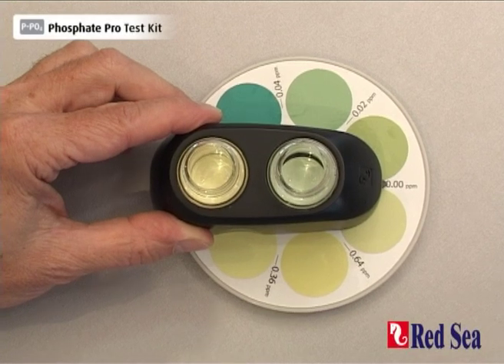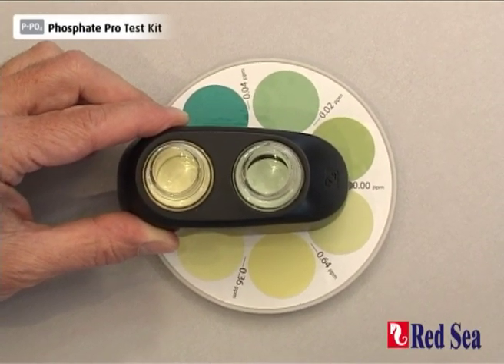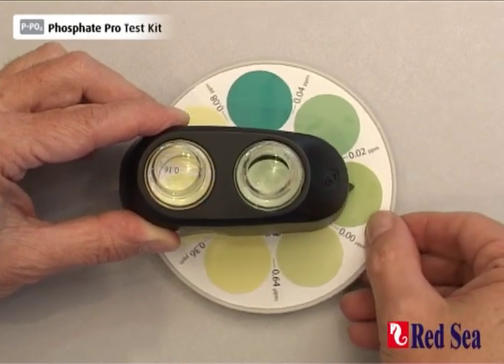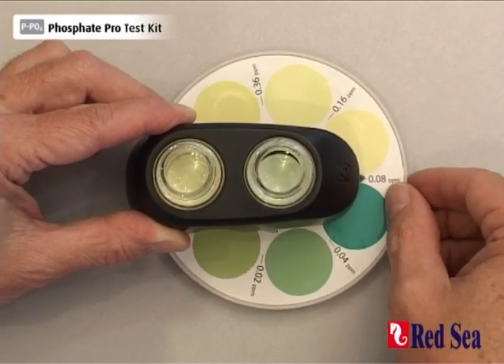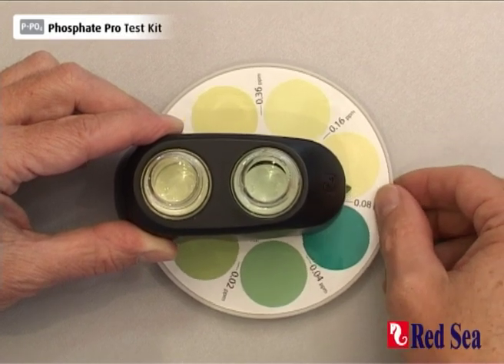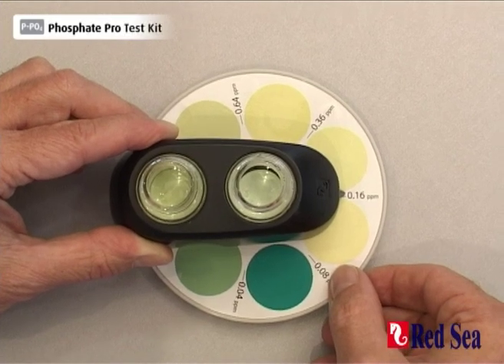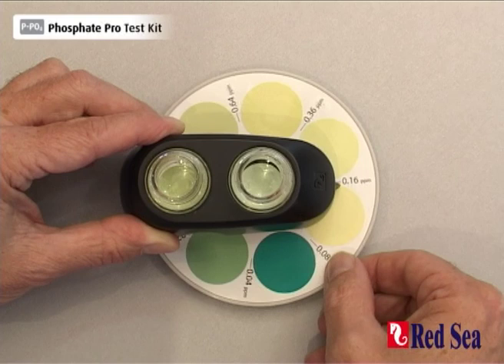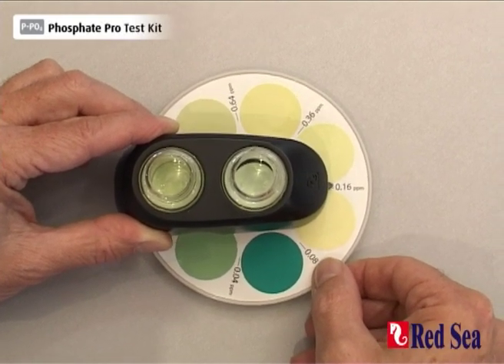Now looking from above, we rotate the disc until we get a color match between the two vials. Starting from the zero, we move around and we see that when we reach 0.08, we have got almost a match, and 0.16 is also almost a match, and therefore our actual reading is probably somewhere in between 0.08 and 0.16.